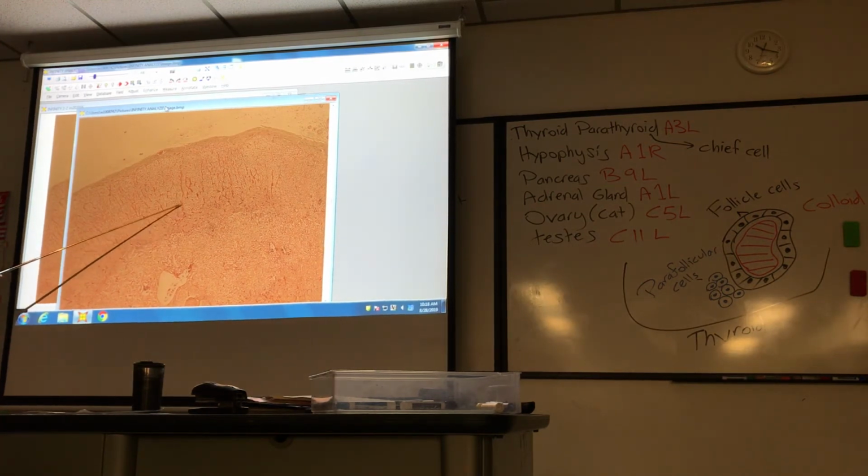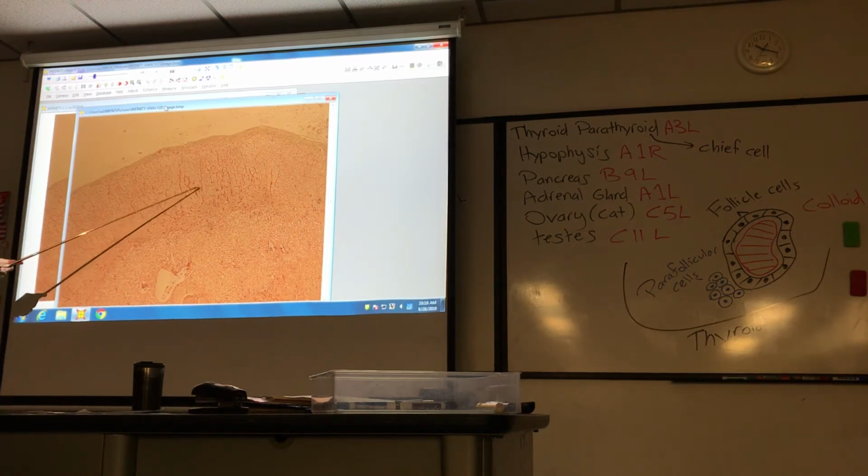See the redness in between the cells? That's like blood vessels probably. But anyways, it's the salt, sugar, sex. So study that. Adrenal gland. Done. Moving on. Okay, ovary.